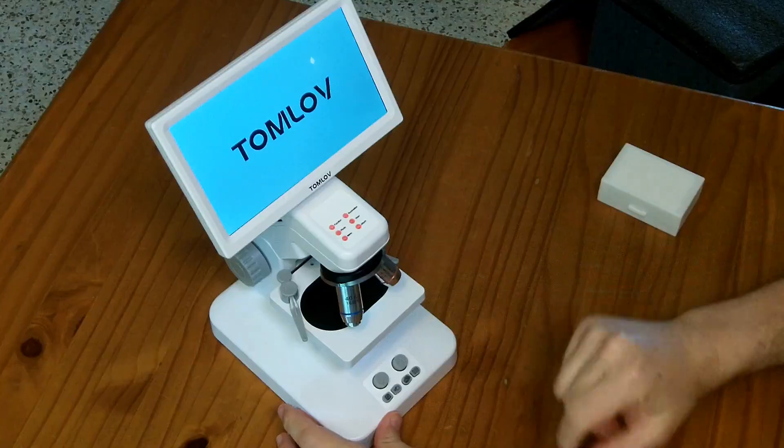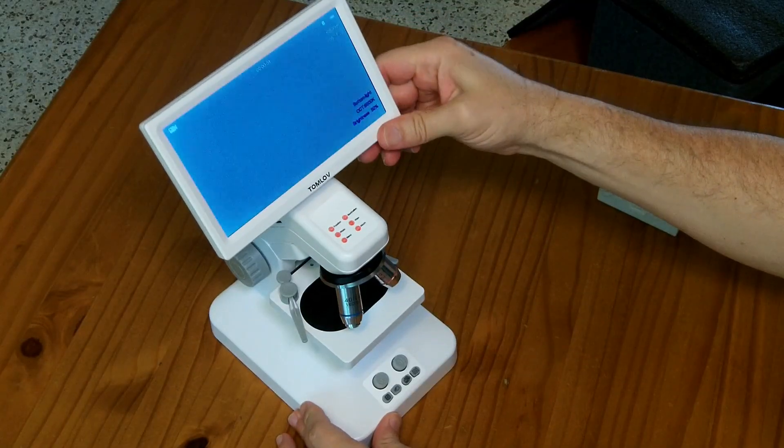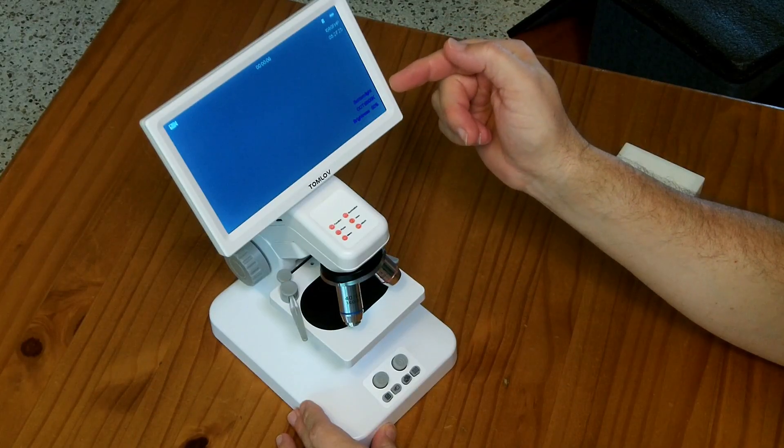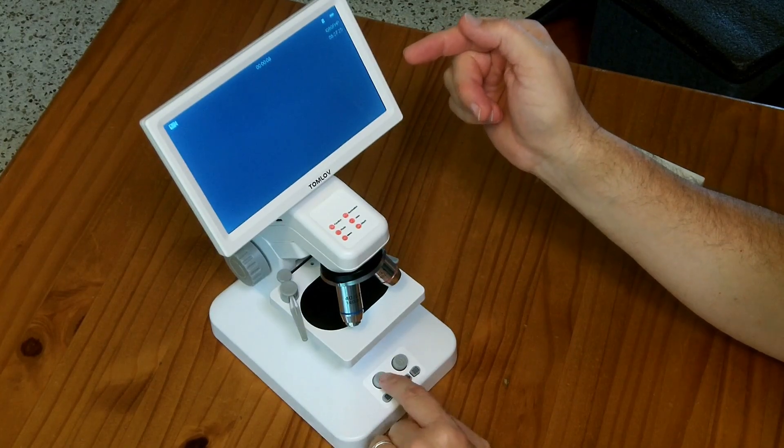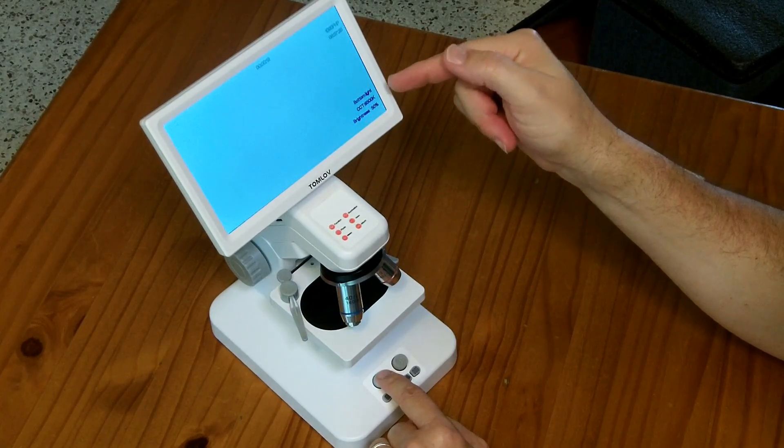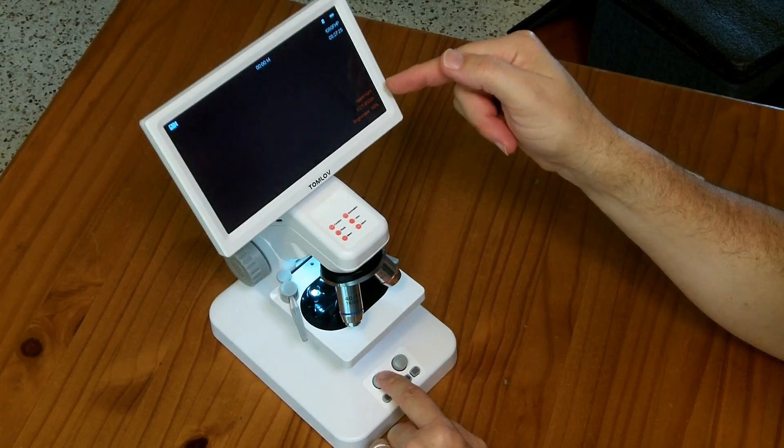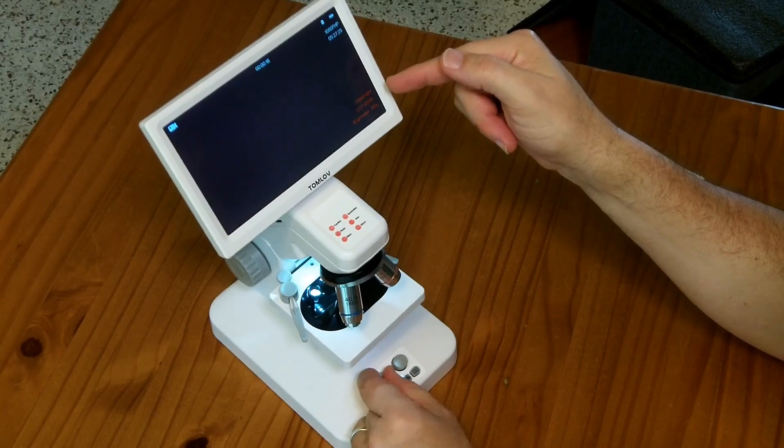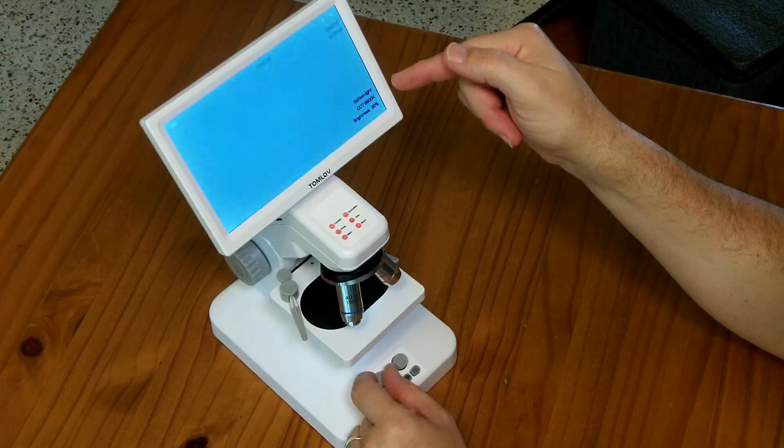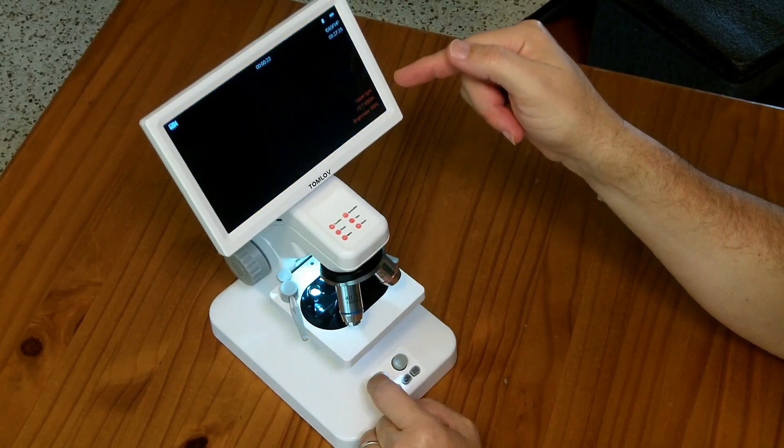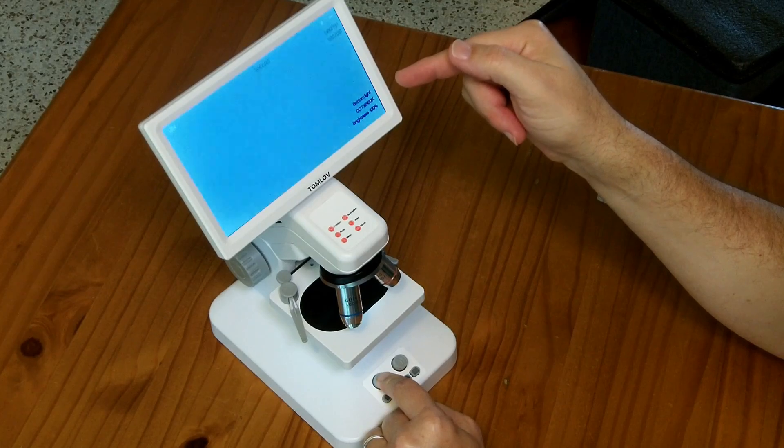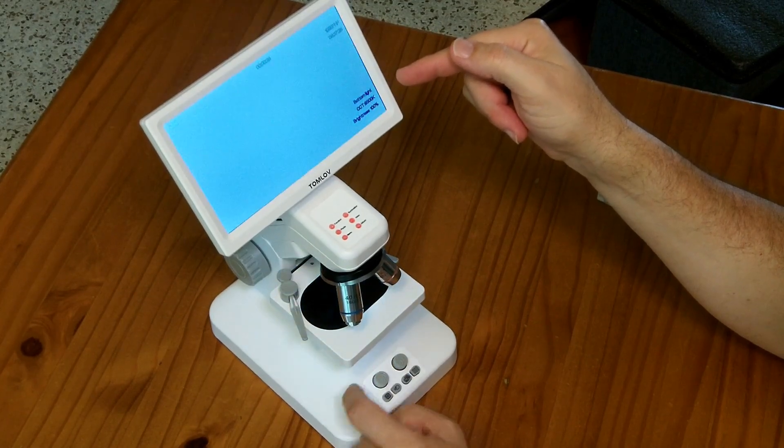The screen is lighting up. It says it's on the bottom light, CCT6500K. So I can push the button on the light button to change between the bottom light and the upper light. I can twist it to change the brightness. I don't know if there's a way to change the color temperature. It doesn't look like I can have both of them at the same time. I have to choose either the upper light or the bottom light.